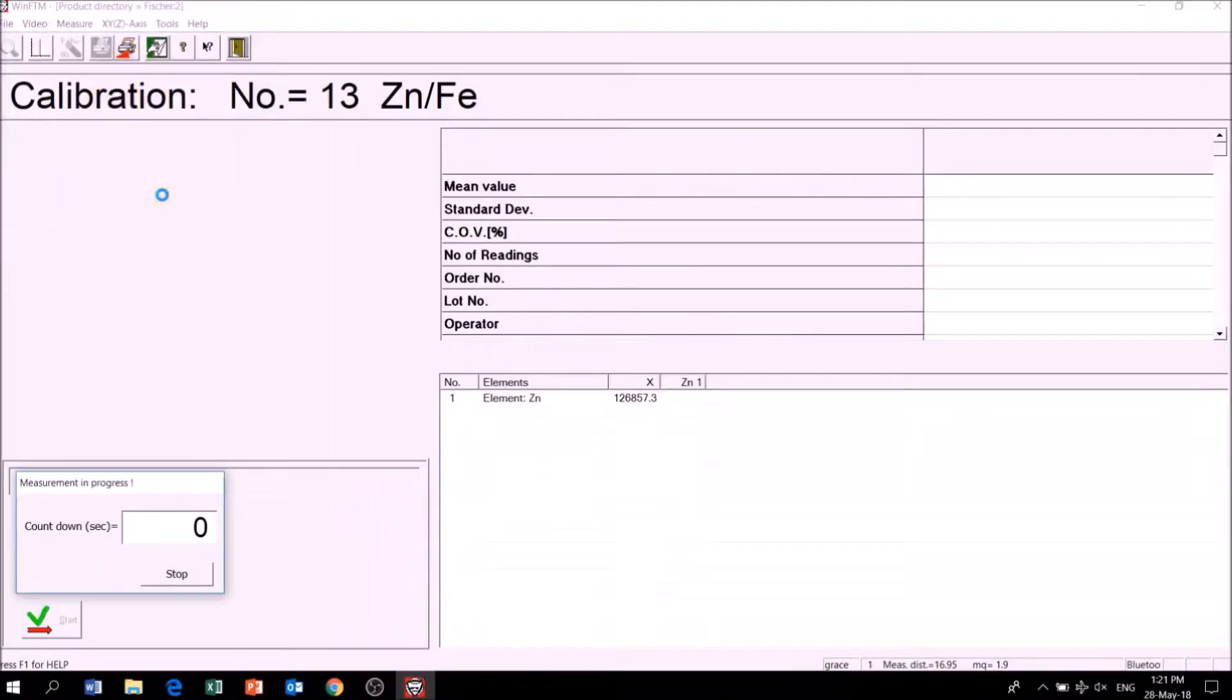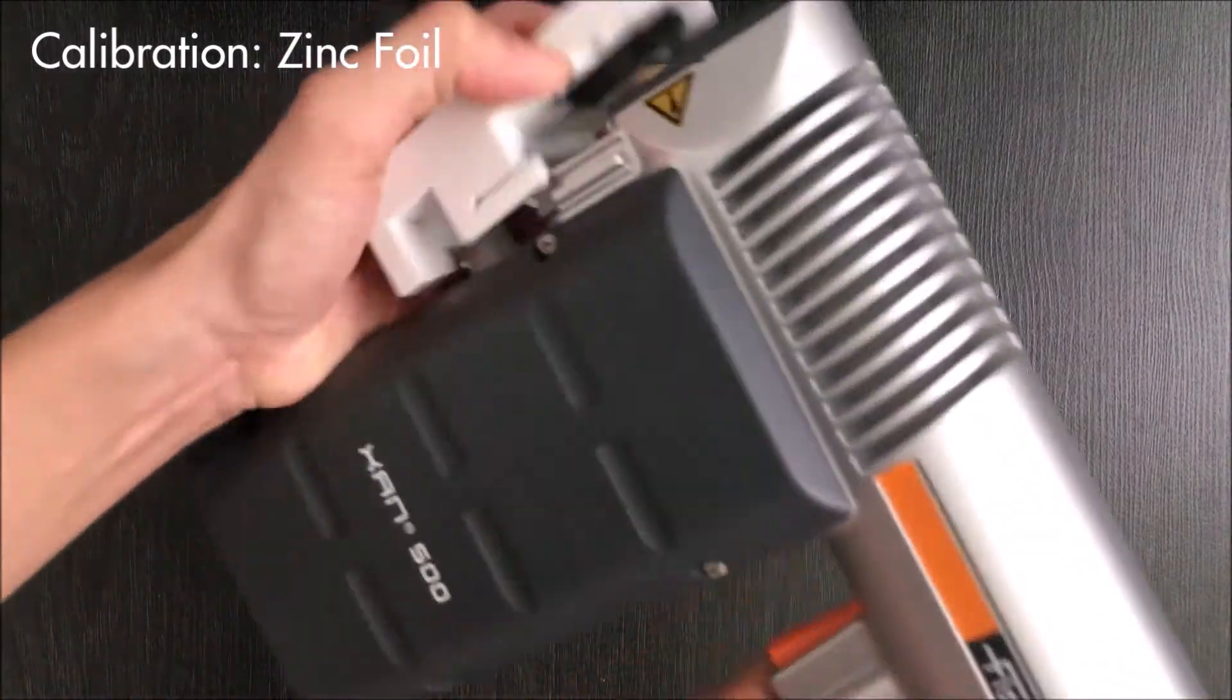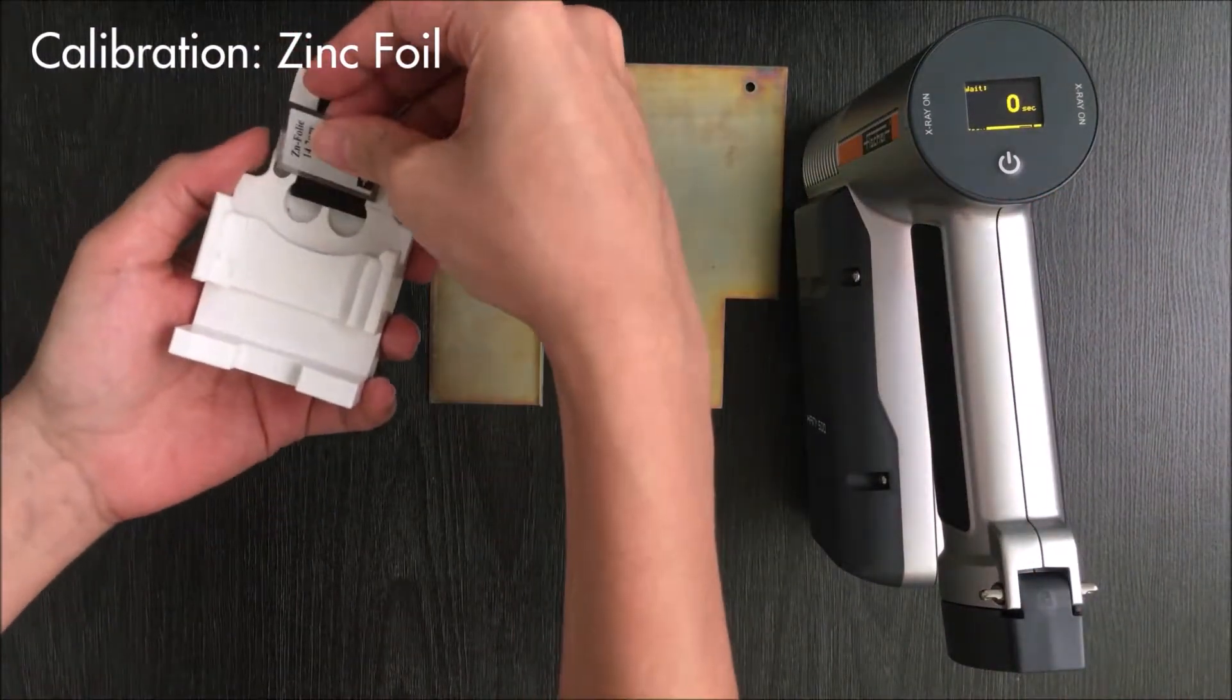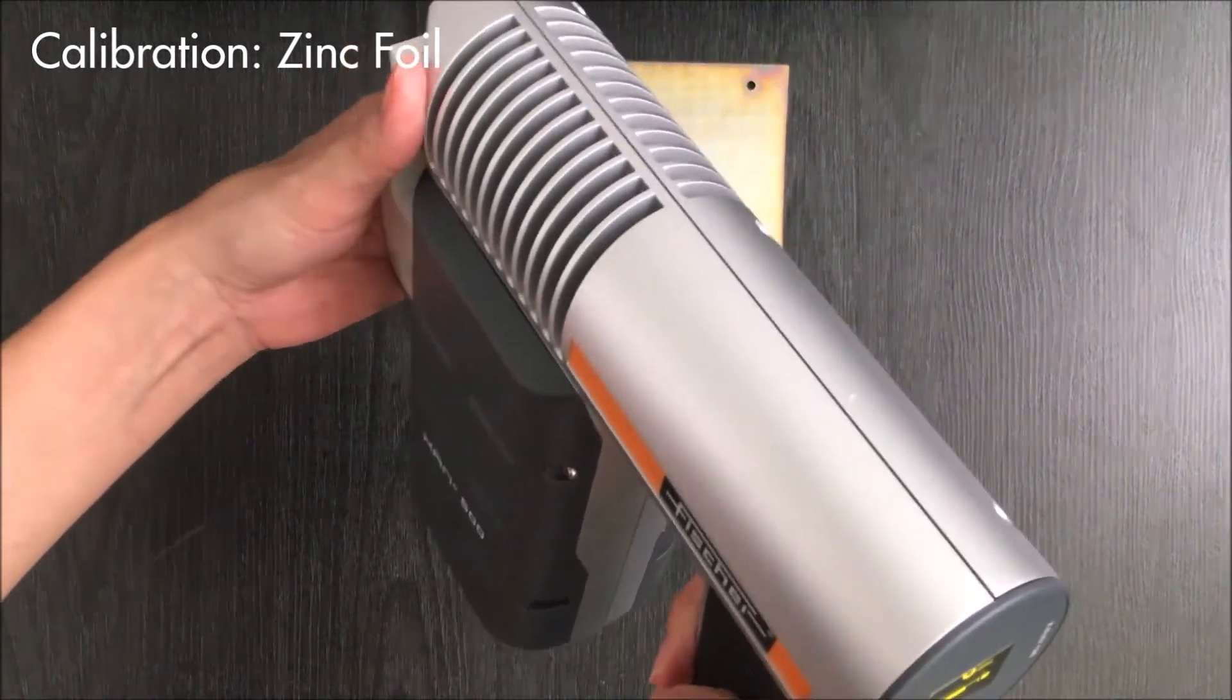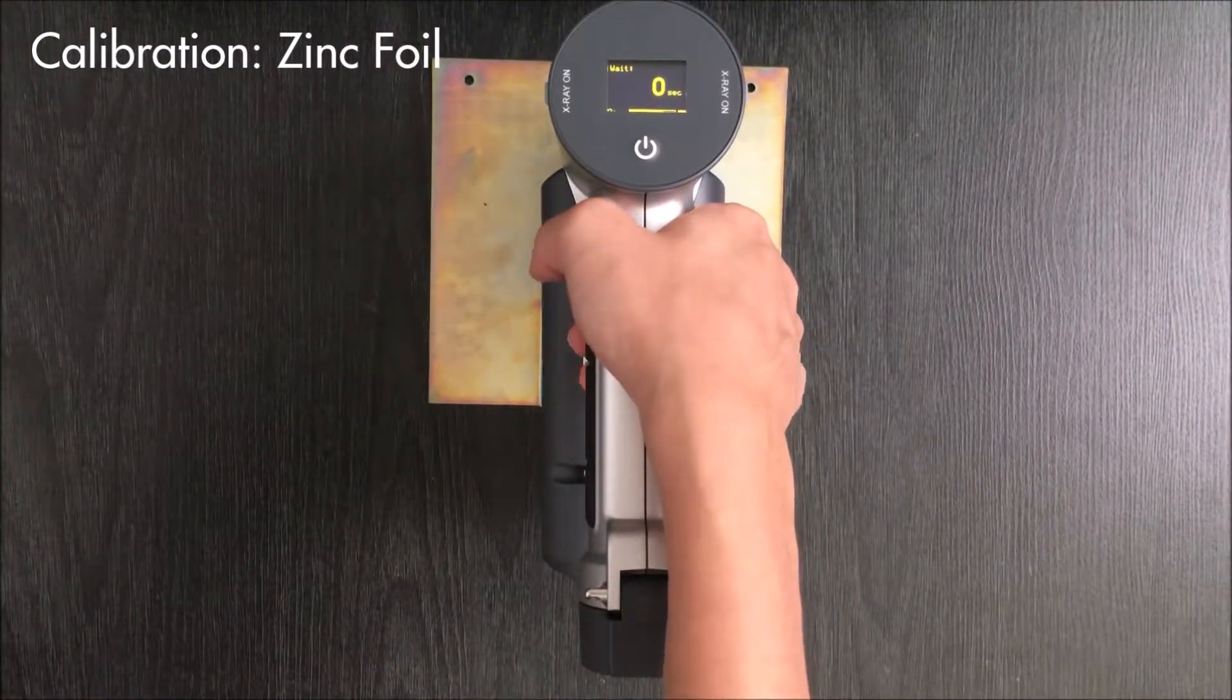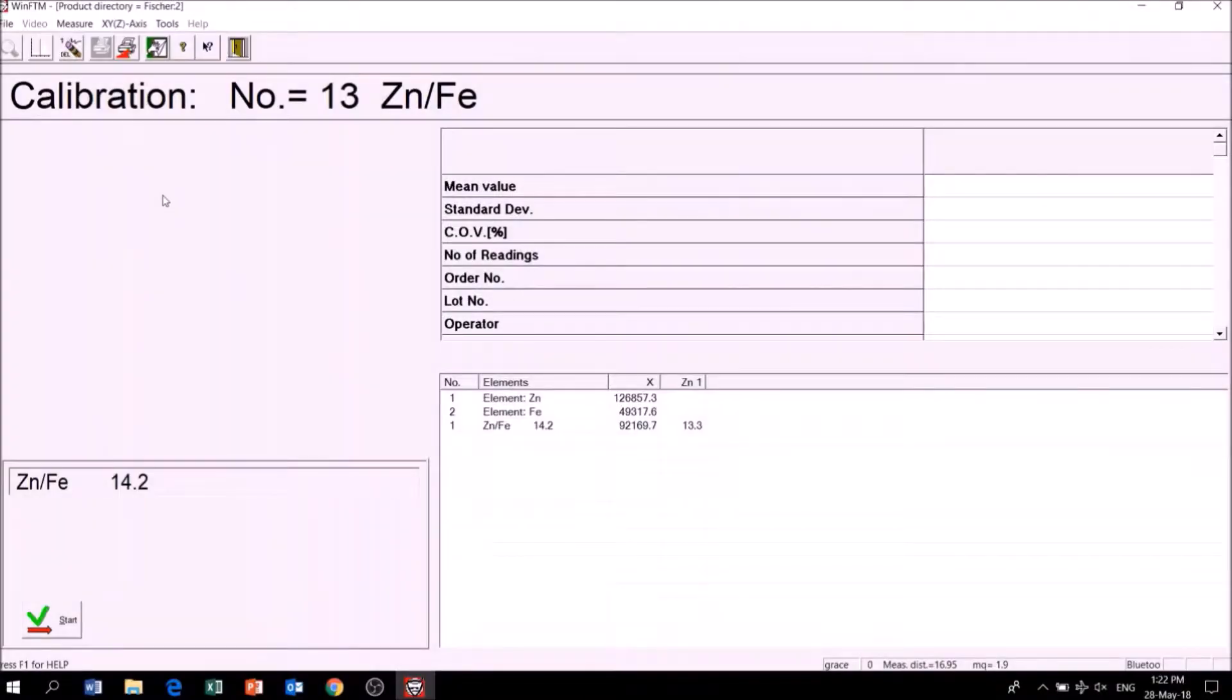Finally, I will calibrate the instrument using the 14.2 micron zinc foil. The calibration is complete.